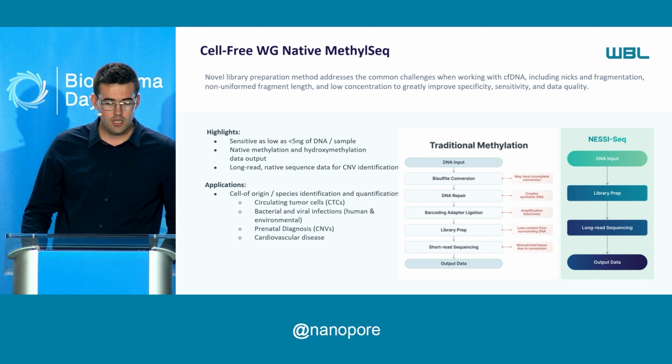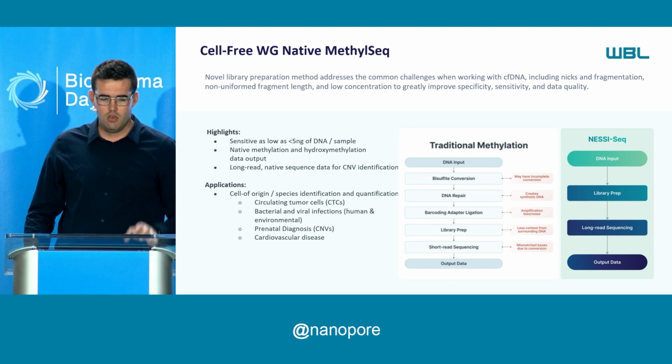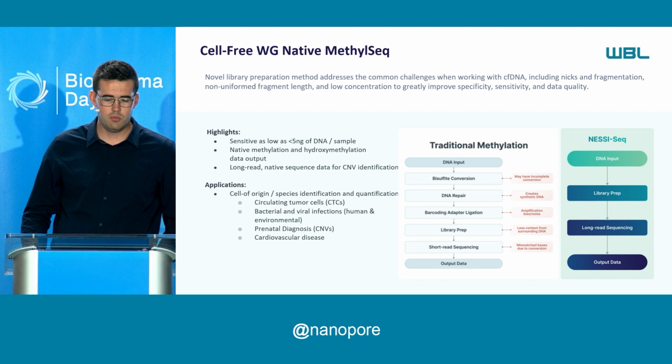In the cell-free approach, the problem we had to overcome is that cell-free DNA is highly fragmented. When you're utilizing the Oxford Nanopore workflows, the DNA needs to come into the pore double-stranded, and if you've got a lot of nicks and fragmented DNA, it causes a lot of problems when sequencing through those nanopores. So we came up with a method that fixes all those nicks and fragments inherent in cell-free DNA, and then we take it through a proprietary library prep that's super quick and optimized for low input. The average sample we put through is roughly 5 nanograms or even less, and we're still able to average anywhere from about 100,000 to 1.5 million reads per sample with 96 samples on a flow cell.